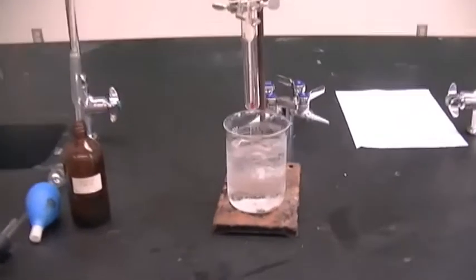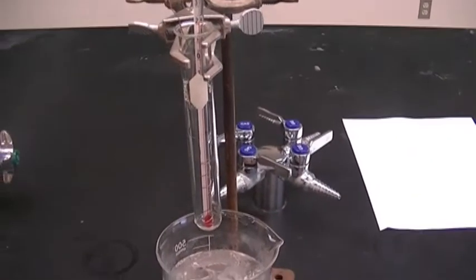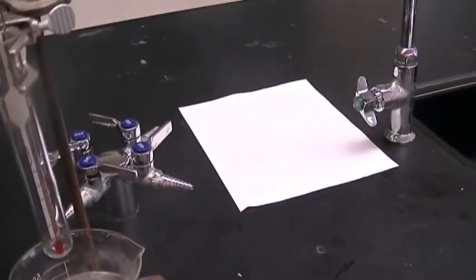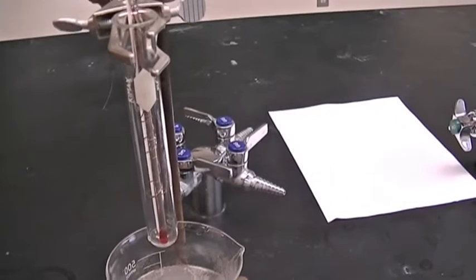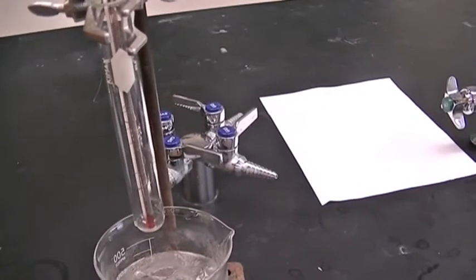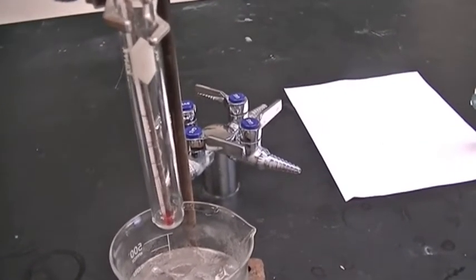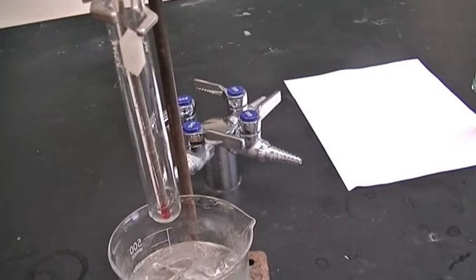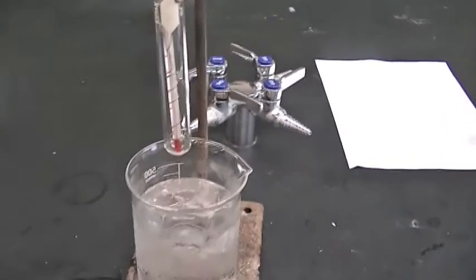All right, so here is our setup. We have our ice bath, we have our thermometer, and you're not supposed to stir with the thermometer because they used to be made of mercury. And so we have this copper coil that I got from experiment 8, and I wrapped it around this thermometer, and I'm going to use this going up and down to stir our cyclohexane.